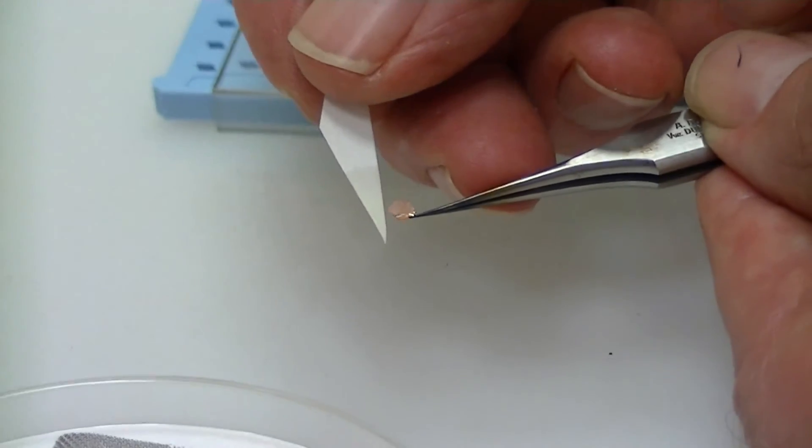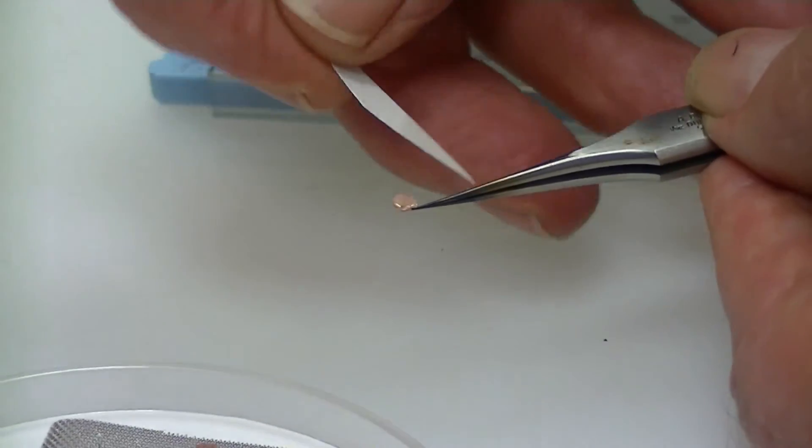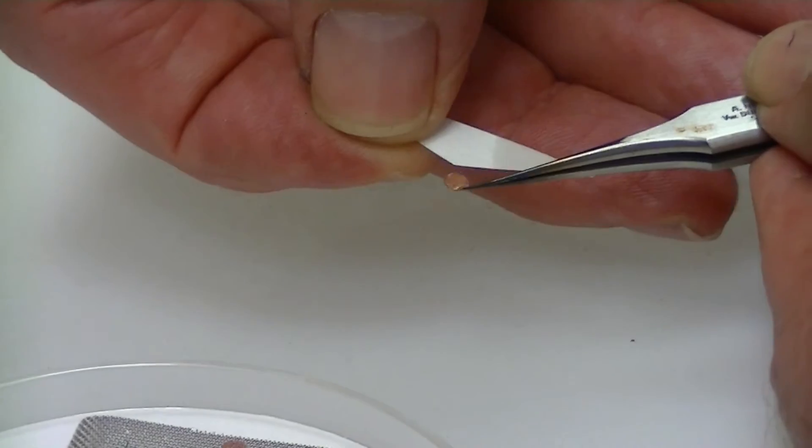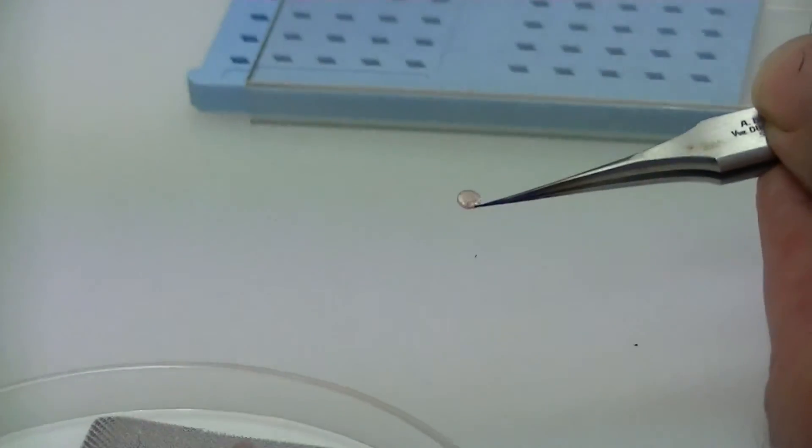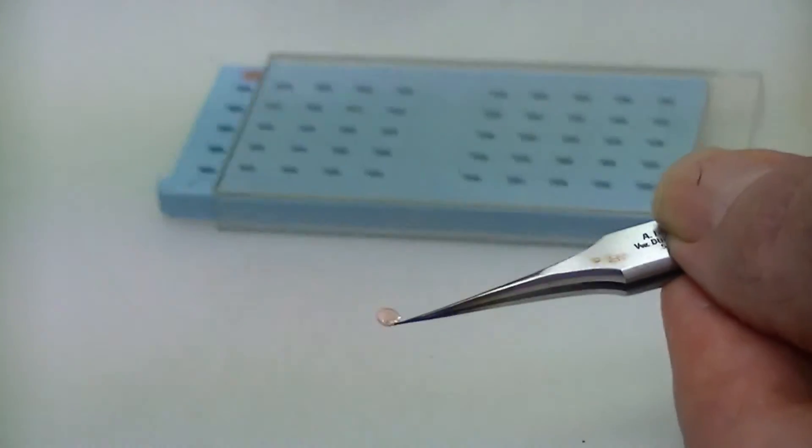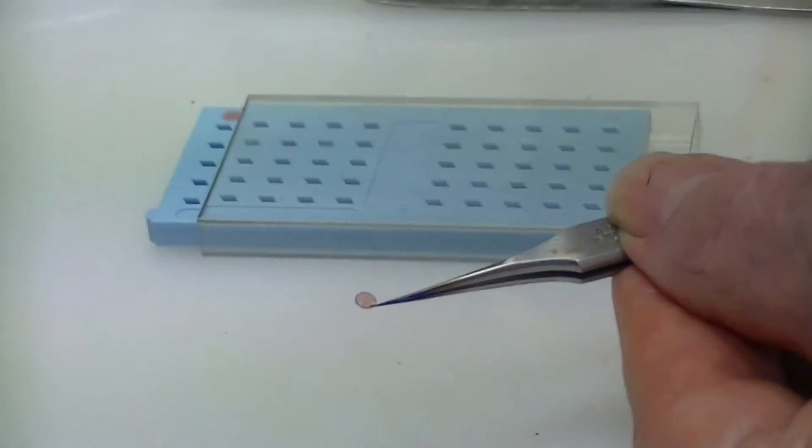When the stain dries down, it will surround the virus particles and they will appear clear against a dark background. So many of the virus particles that you see in lectures on electron micrographs have been stained in this way.